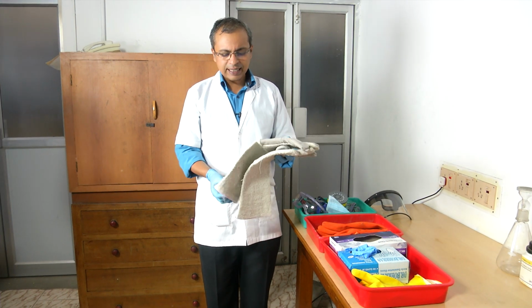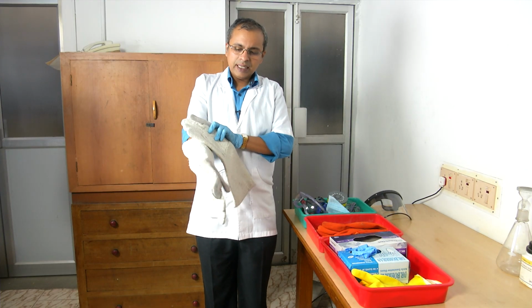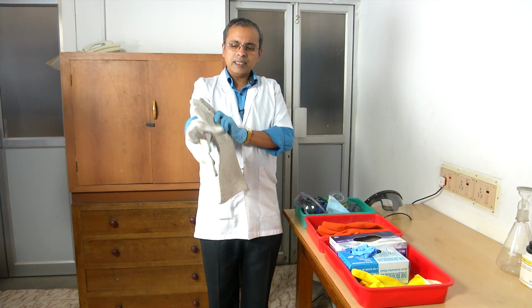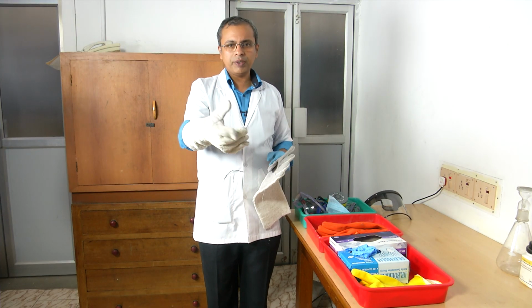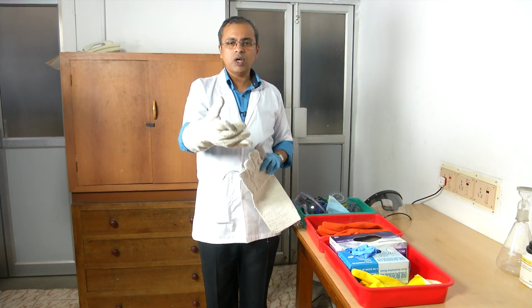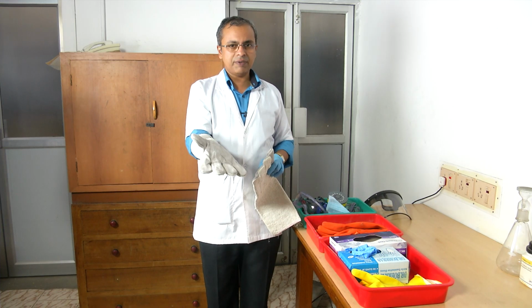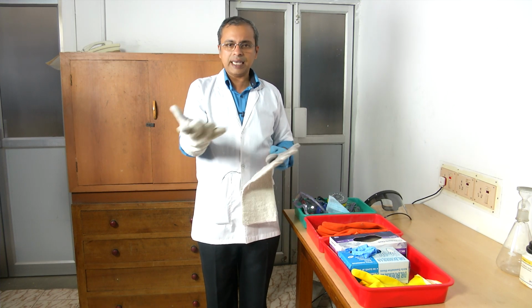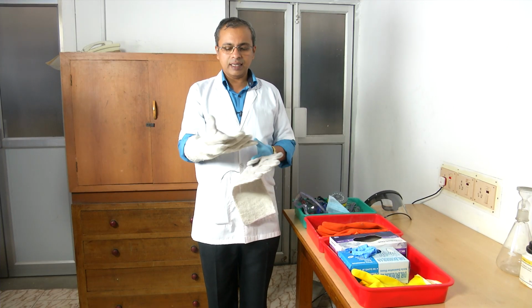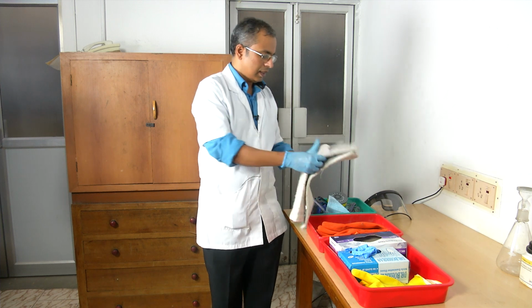These are slightly large gloves which are usually a little cumbersome to handle samples with, but you have to get used to them if you are going to be holding tongs which are likely to be hot, or if you need to handle a sample that is a little hot. These gloves add to the safety equipment in the lab. You should have a set of these gloves handy in your lab so that you can use them as you would need them.